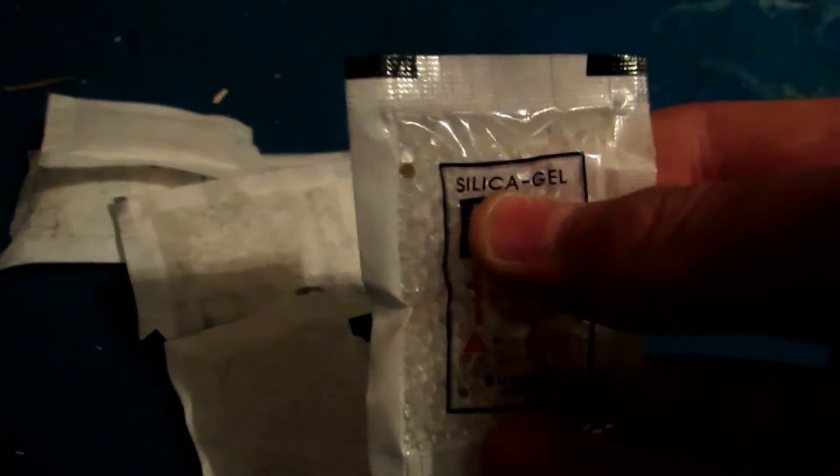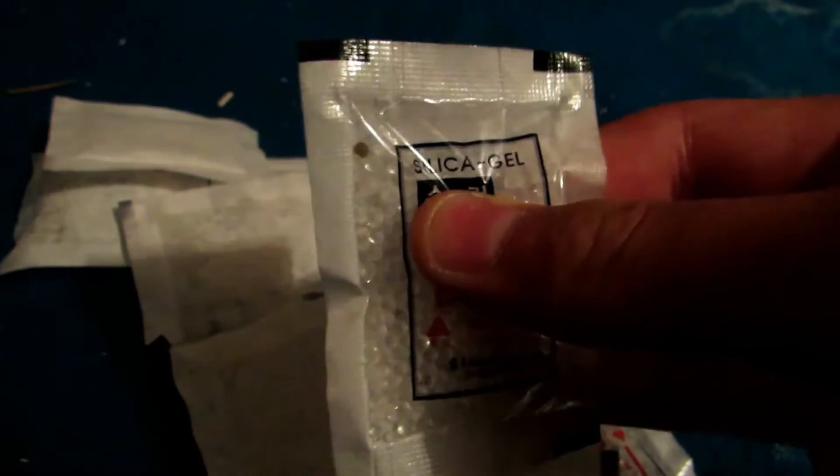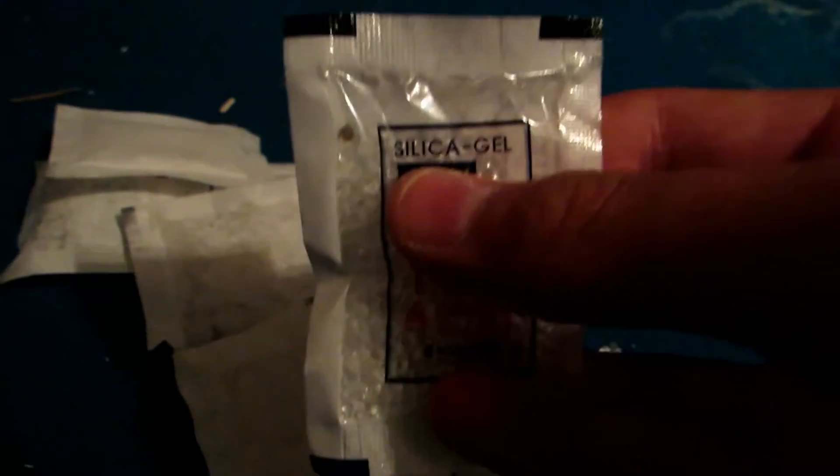Today we're going to be trying something totally different — this silica gel. I've been saving this from different desiccant packets. This is particularly mostly from seaweed; you can buy seaweed in packs and they almost always contain silica gel. I'm going to be opening all of this and powdering it in this blender as soon as I clean it out. Silica gel is silicon dioxide.